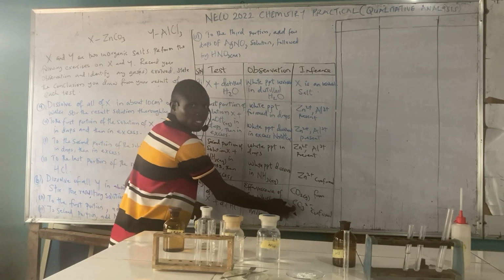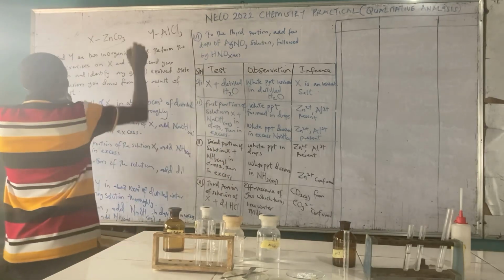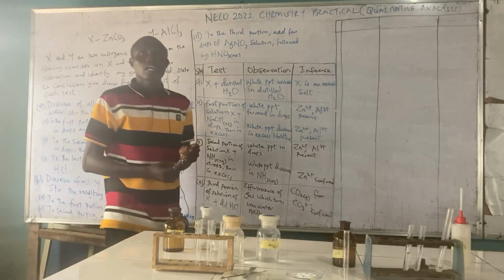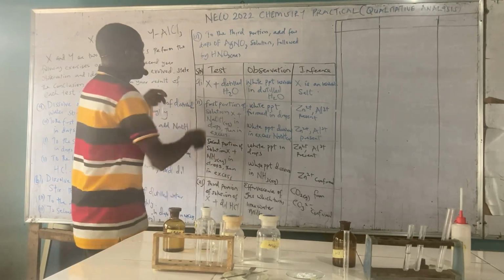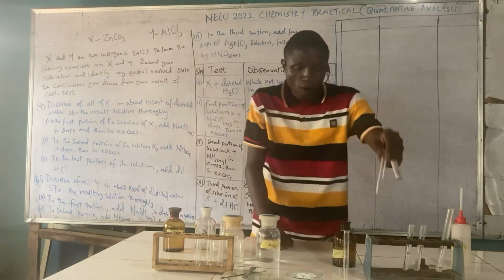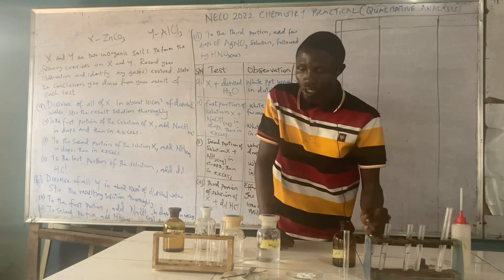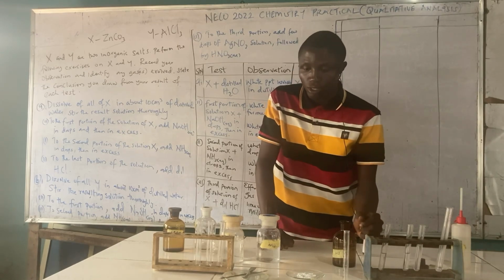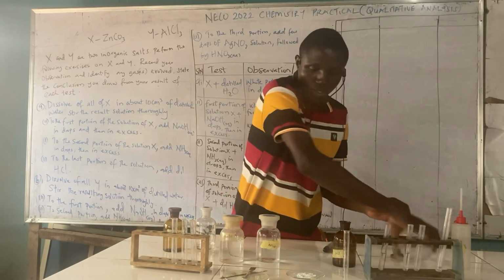Now, from here we have confirmed zinc 2+, and we have confirmed CO3 2-, which gives us zinc carbonate. So maybe we are done with the first salt, which is zinc carbonate. Now, the next thing is to deal with the second salt.